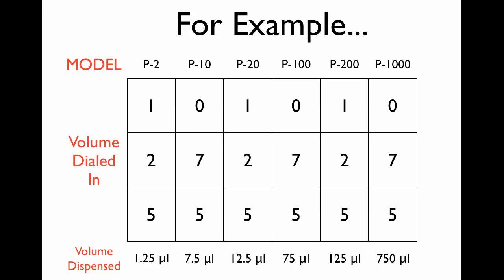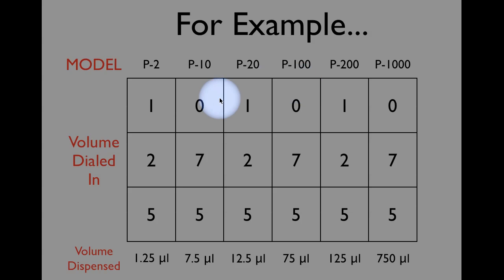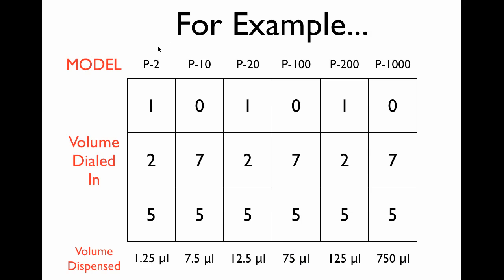You're going to see a little window with three numbers in it. And the different models of micropipetters will be dispensing different volumes depending upon what shows up in the window. So, for example, if you're using a P10 and you dial in 075, what you actually get is 7.5 microliters. If you dial in the same numbers, 075 on a P100, you get 75 microliters. So, I really do encourage you to spend a lot of time. I give my students a little handout on what the different models are and what the dispensed volumes will be. It does take a while. Eventually, you're going to get to a point where you don't even think about it. But in the beginning, this can be really confusing if you're doing an experiment or a lab which requires you to use multiple models all at one time.